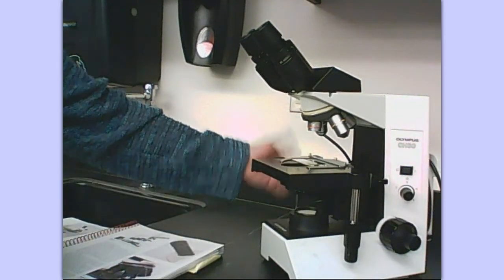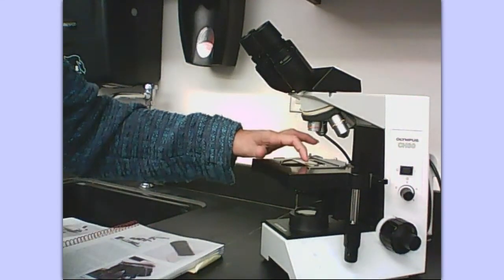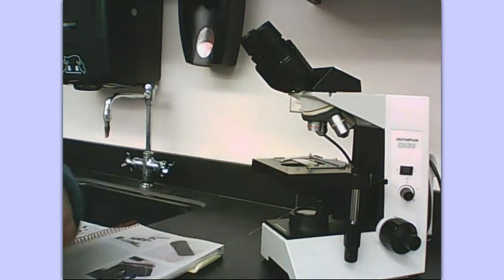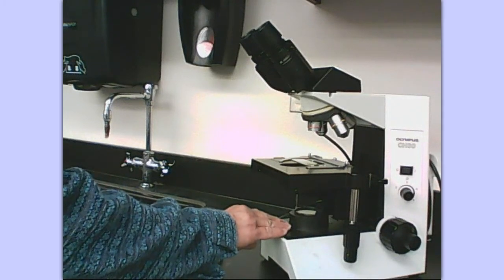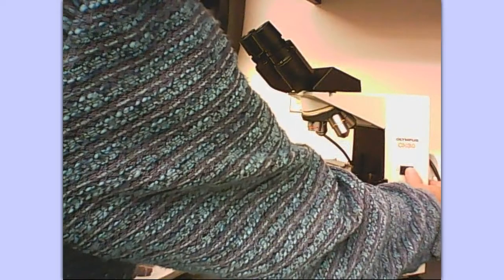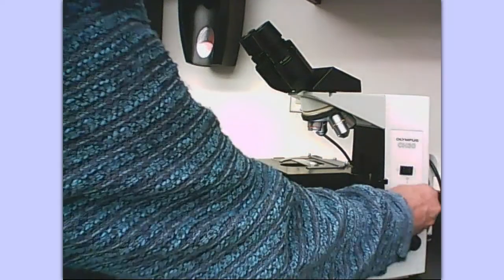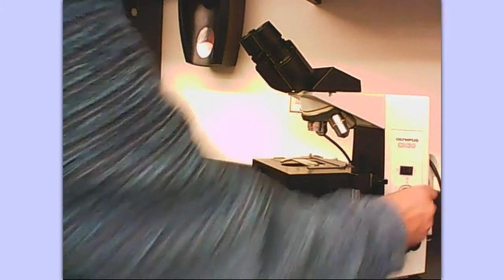On this particular microscope you can raise or lower the condenser, and that also plays a role in how much light comes through. Your slide needs to be over that opening above the condenser, in the center of the stage. Here is the illuminator switch — the light switch. This particular microscope comes with a dimmer switch so that you can adjust the amount of light coming through the microscope.